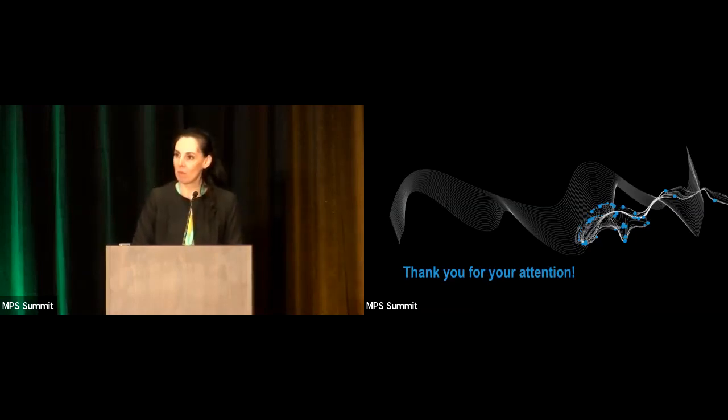For the synovial chip model, what kind of cell did you include in that chip? So the cells that we used to sit on top of the membrane were synovial fibroblasts, primary human synovial fibroblasts. Okay, thank you.